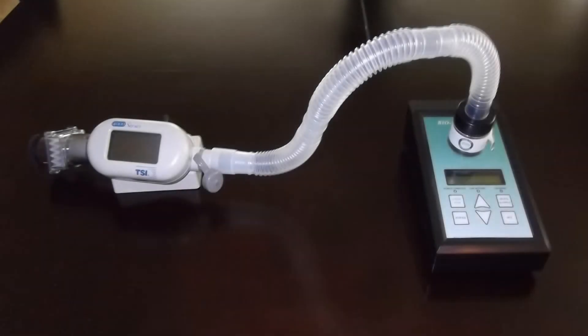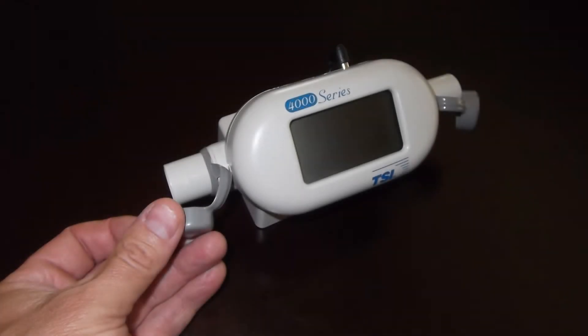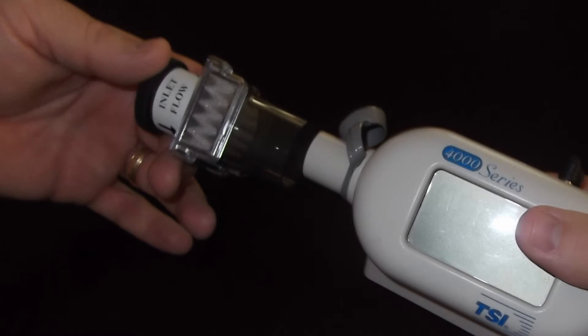To perform primary calibration of a bio-pump or bio-air pump, first remove the caps from both sides of the TSI calibrator. On the inlet side of the calibrator, connect the debris filter.